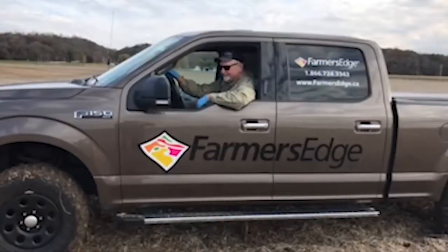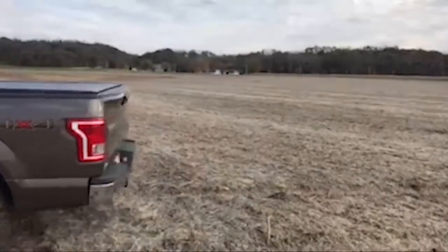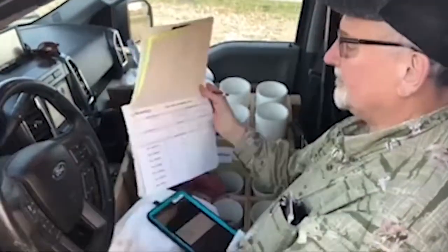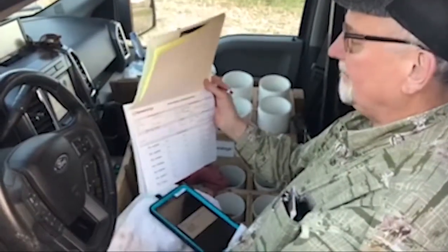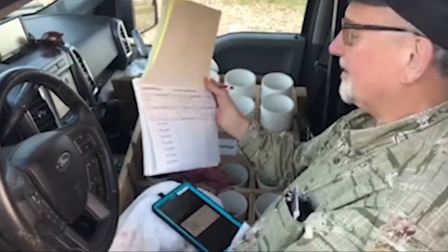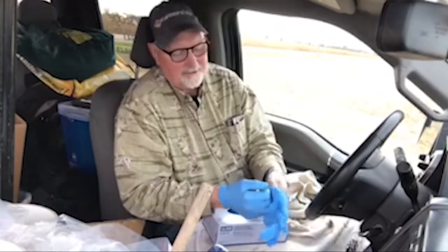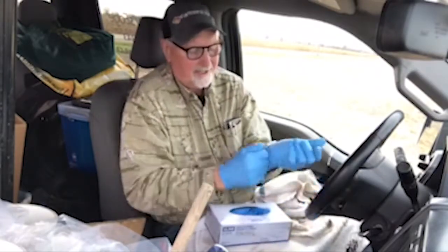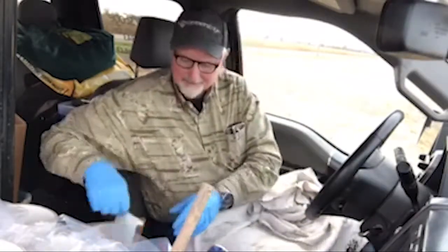We're going to go soil sample. First thing I do when I get to the field is I fill out the paperwork, get that finished, and label all the bags, then start the sampling process. There could be something on my hands that will contaminate the samples, so this prevents that from happening because we want to give the customer the best sample possible.